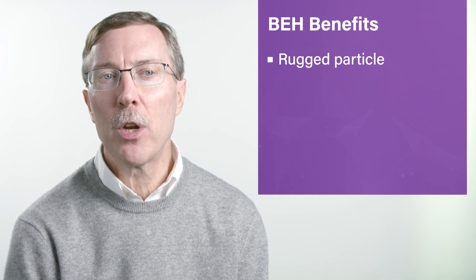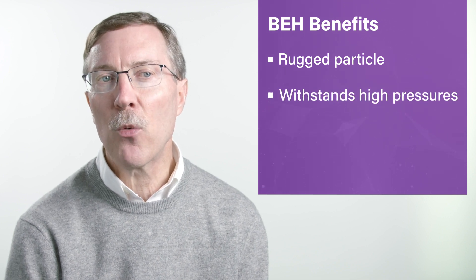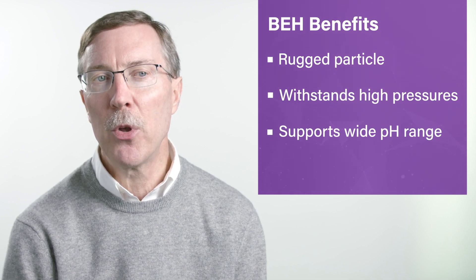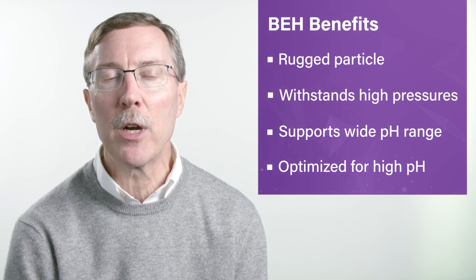The most distinguishing characteristics of the BEH particles as compared to XTERRA is their ruggedness — their ability to withstand not only higher pressures but also a wider range of pH. The ability to withstand high pH mobile phases is an order of magnitude better than it is for XTERRA.